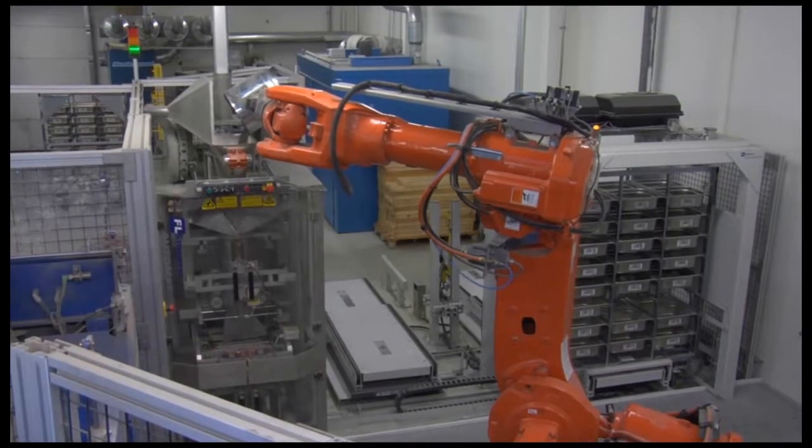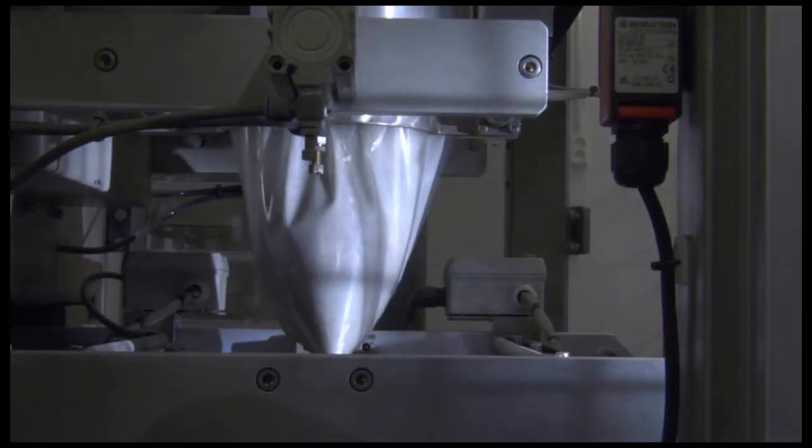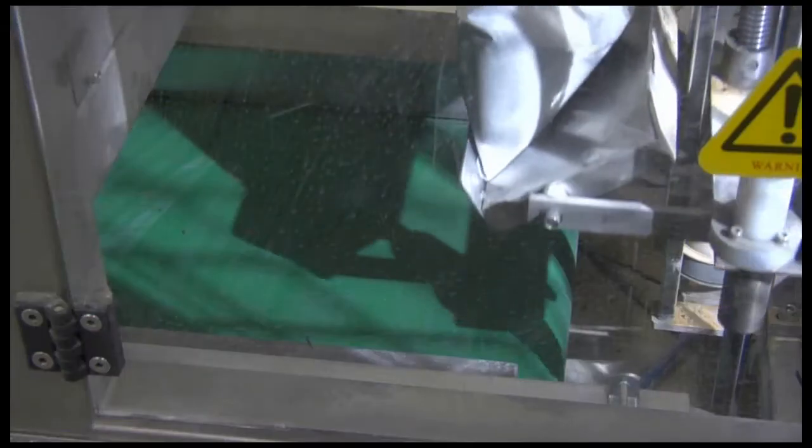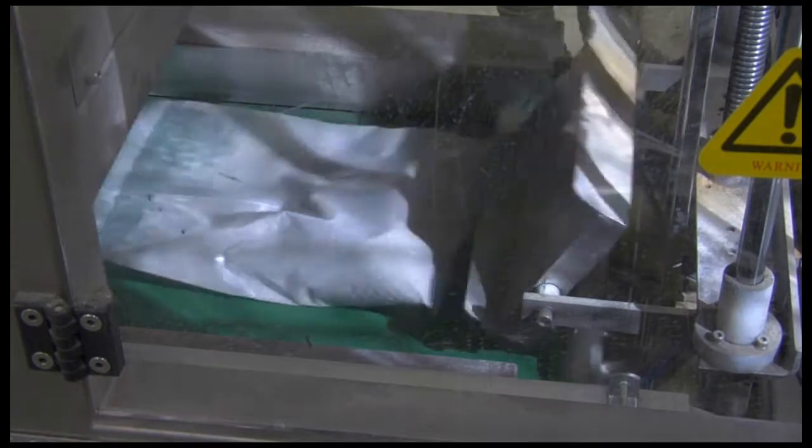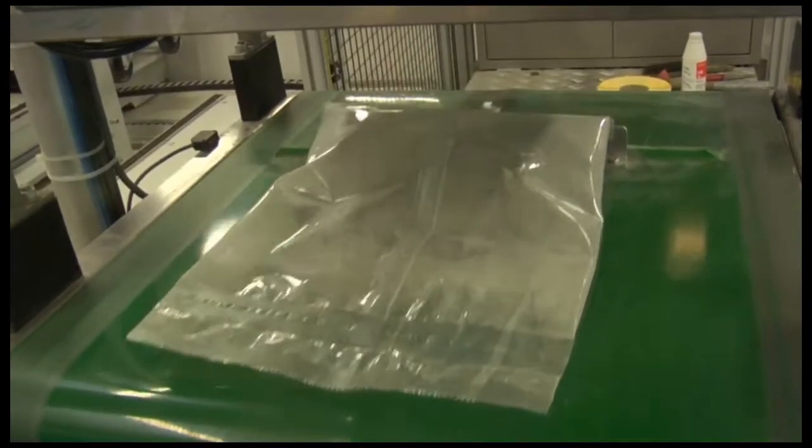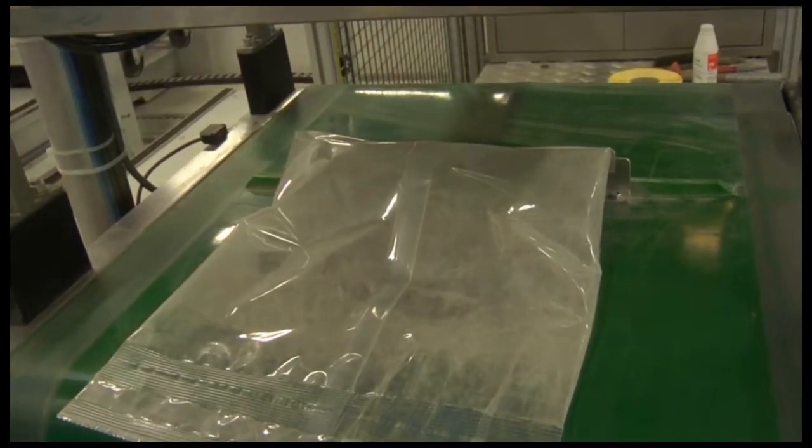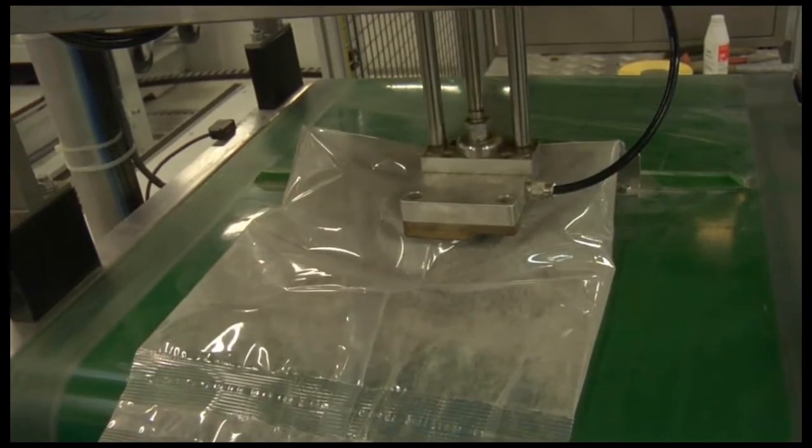The archive sample is bagged in a forming, filling, and sealing machine. Cross-contamination is avoided as the sample feeding tunnel is flushed after each sample. The archive sample is barcode labeled for easy identification before leaving the cell.